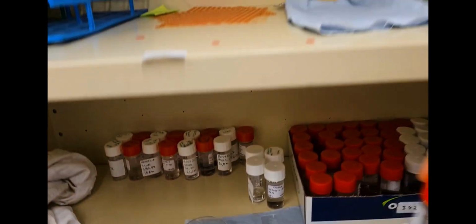This is my shells, and these are the macerations. Maceration just means we dissolve the rock in a load of acid to get the organic stuff out, and that's what all this black stuff here is in this liquid. All those tiny little flakes are fossils, so there's a lot of them for me to go through there.